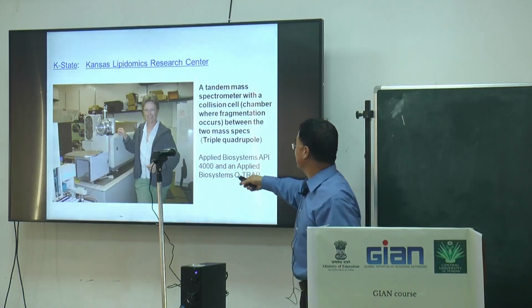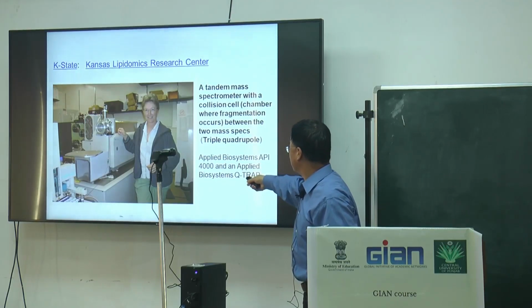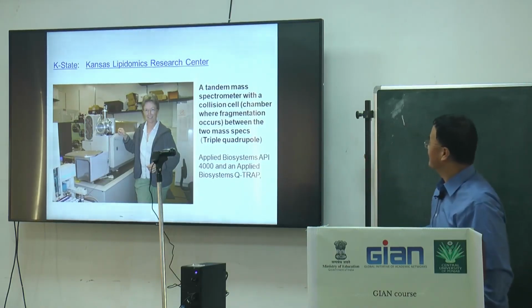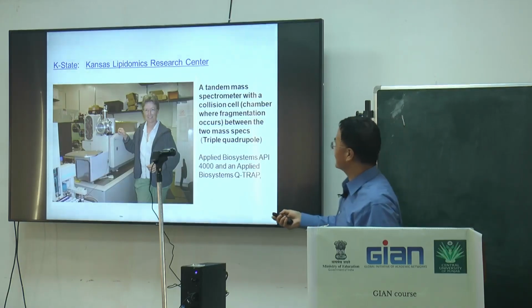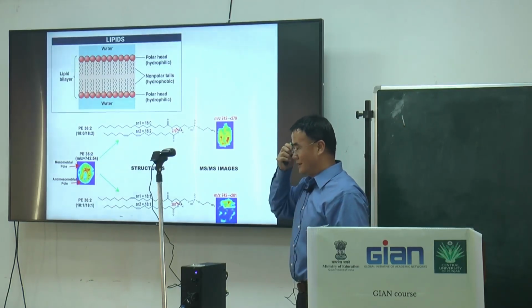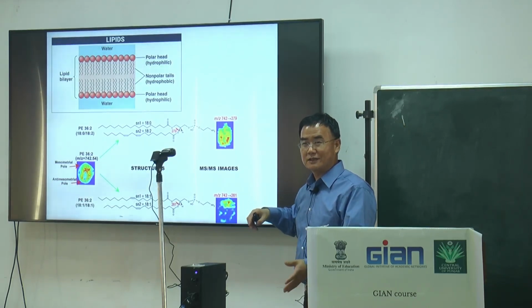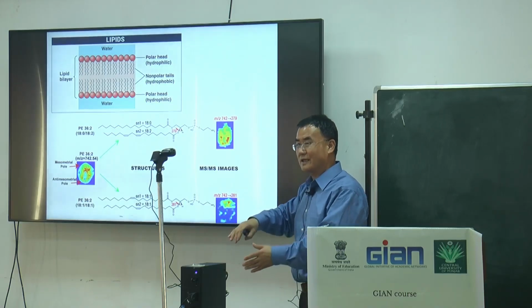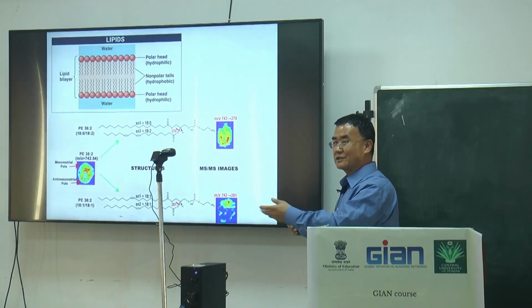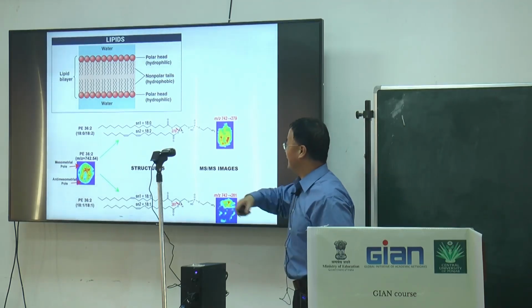They also have other brands like Q-trap or ABI LCMS. I just give you the basic chemical structure of this molecule, so later you will understand how the breakdown happens when we determine structure or establish a method.